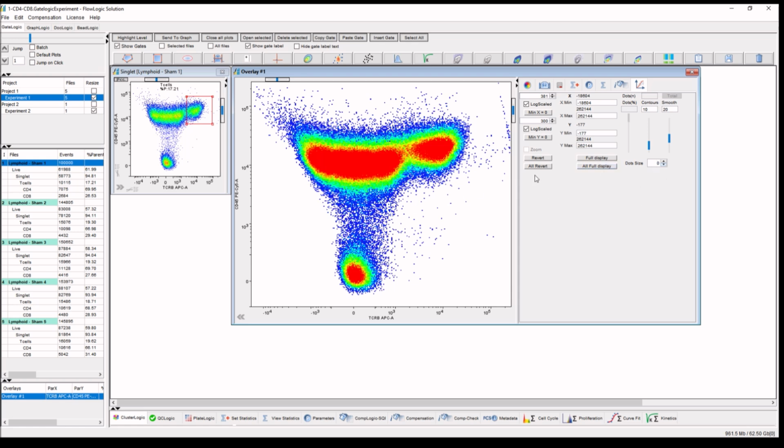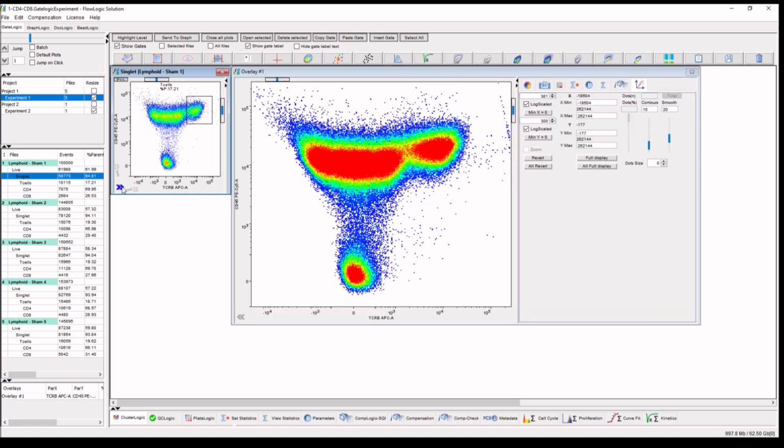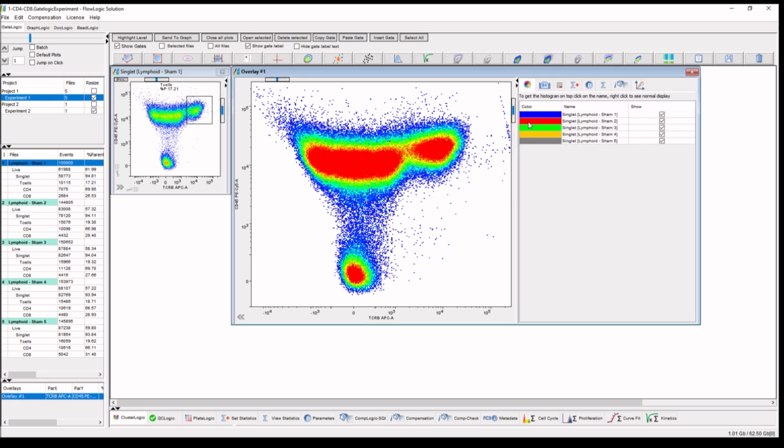You can see how the dots work, and here you have all the full functionality that you have. You can practically do the merging, and in any case your merge file will always be linked to the original files.